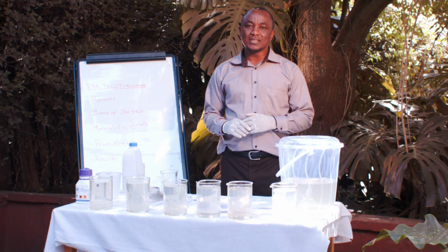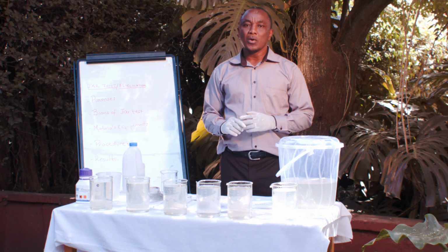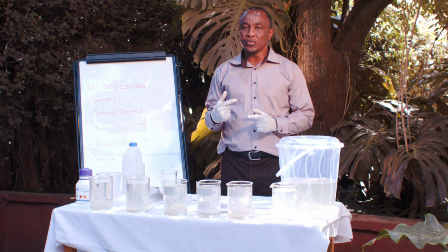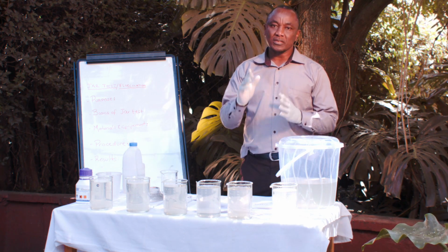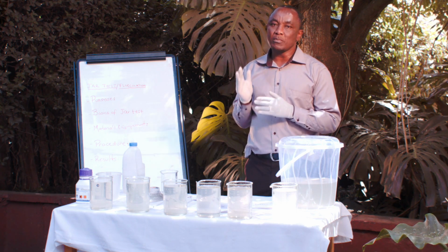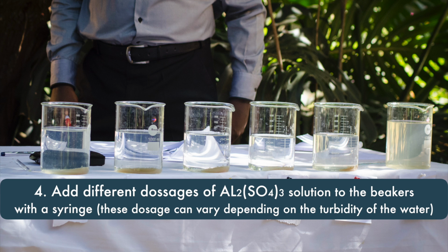Once the beakers are filled with 1 liter of water, we need now to dose the different beakers with different dosages of aluminium sulfate solution. The first beaker, we are going to dose 1 milliliter of aluminium sulfate solution. The second beaker will dose it with 3 milliliters.